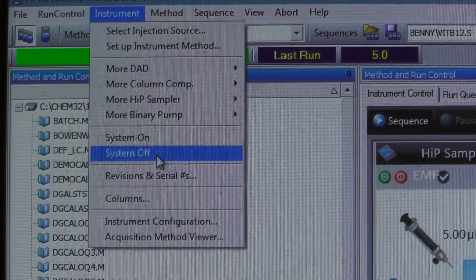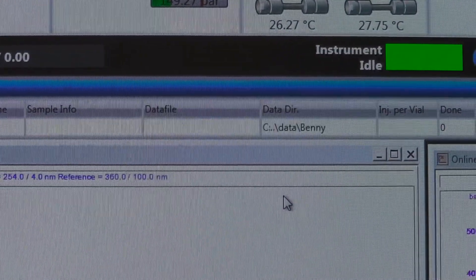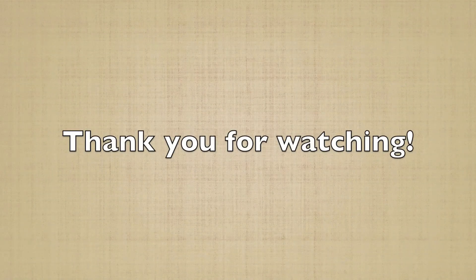After you've completed your run, click on Instrument and then System Off to shut down the system.